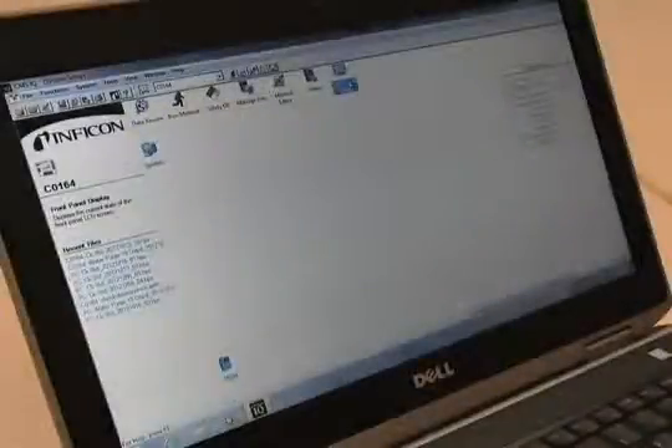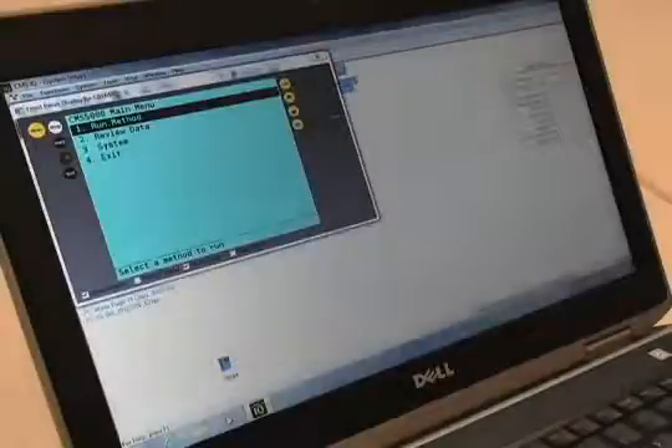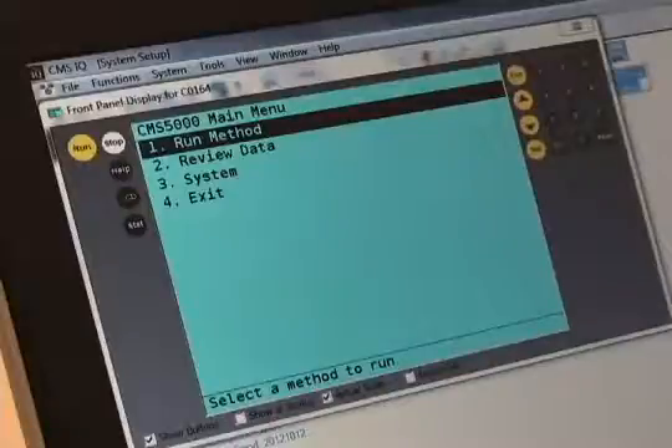Alternately, the CMS5000 can be operated from a laptop using CMSIQ software or the front panel display emulator.